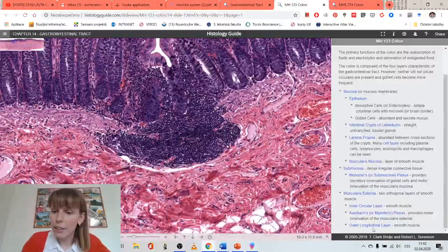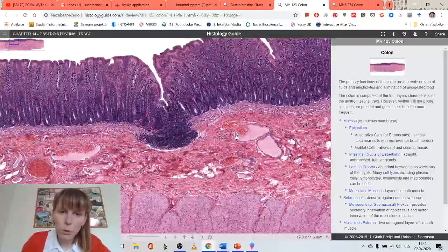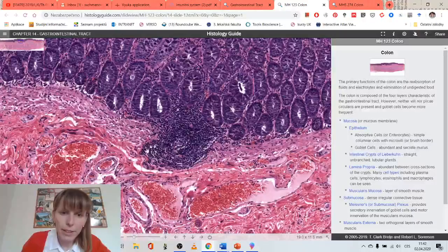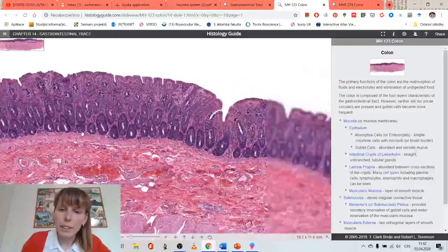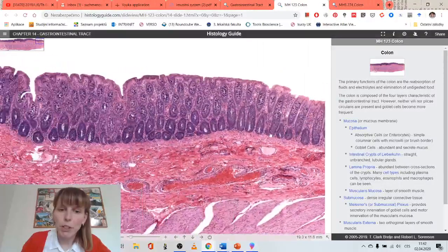They don't mention it in the legend here. So this is what you would be looking for. Here is another example, even with the activated center. So this is a B dependent area. In the lamina propria, you have a lot of accumulated lymphocytes waiting there to be activated by antigens presented to them, which come from the lumen.